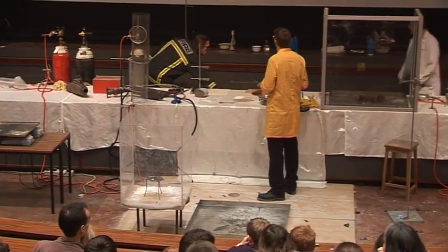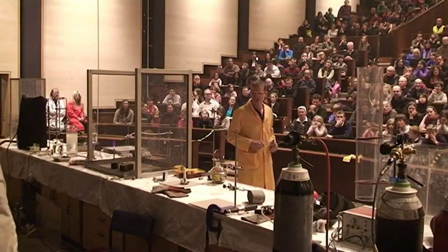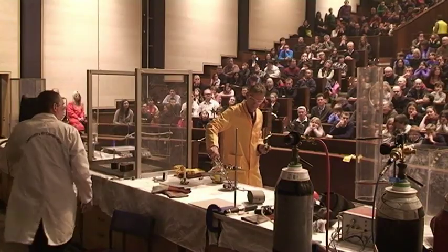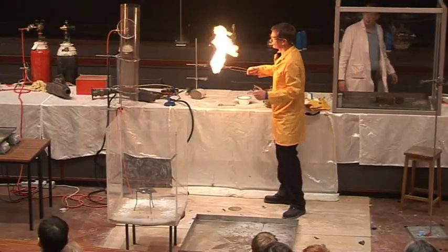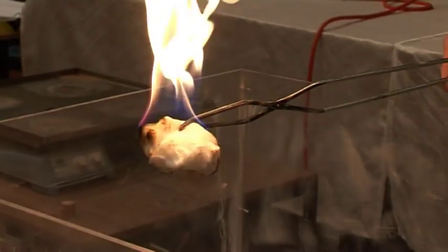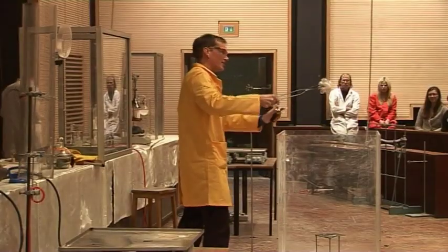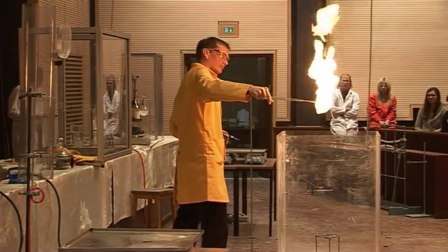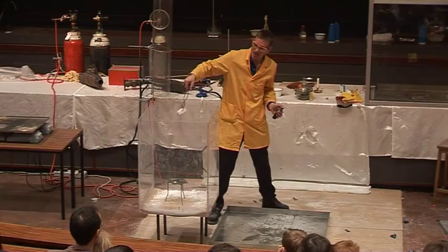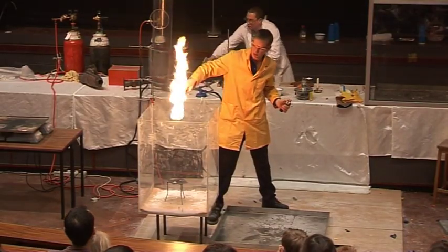So I'm going to put into this some petrol, some cotton wool soaked in petrol set alight, and it should be able to put it out. Okay. So here we are, burning petrol into the carbon dioxide. And it's gone out. Let's try that again. So carbon dioxide is heavier than air, so it's staying in the tank. But as soon as I put the burning petrol in, it goes out.